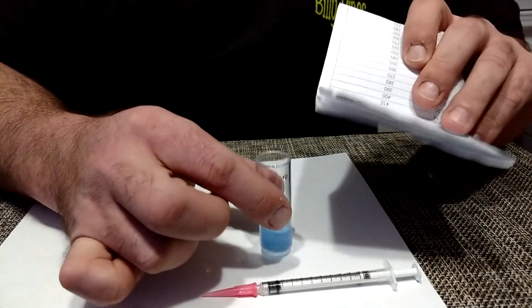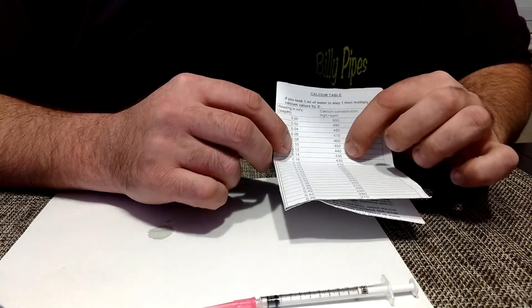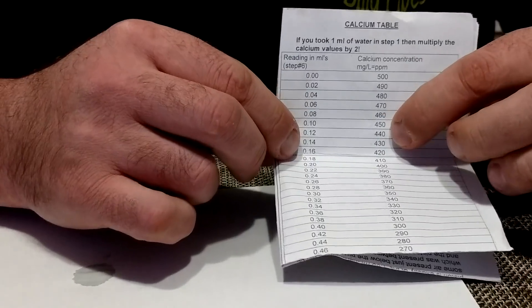Now if I look at the .12 on my grid, my calcium is at 440.